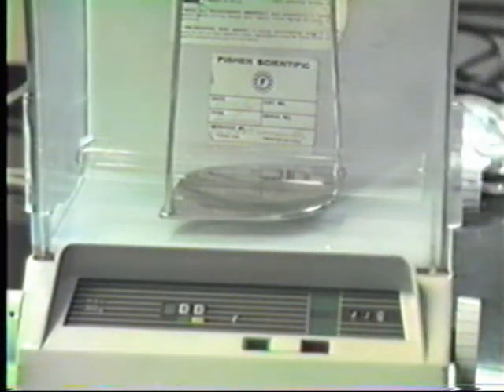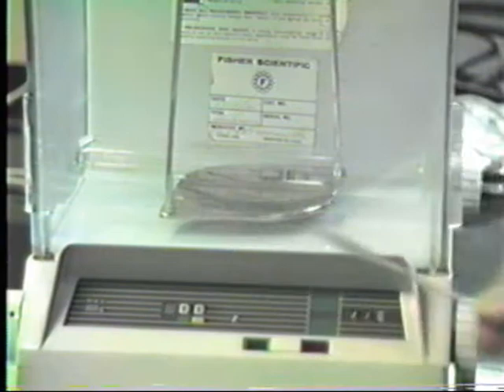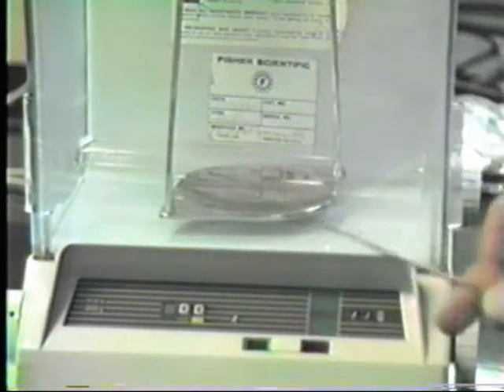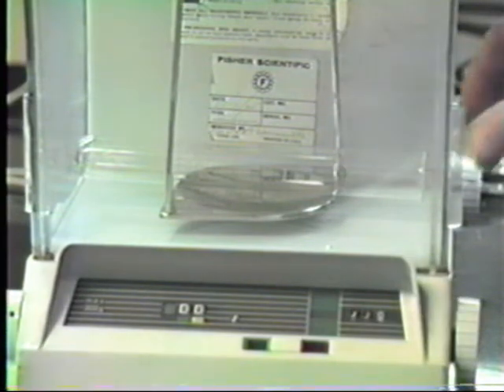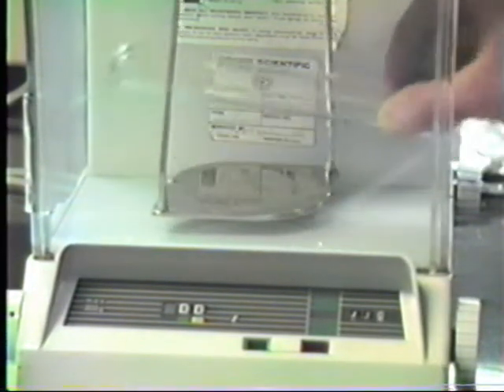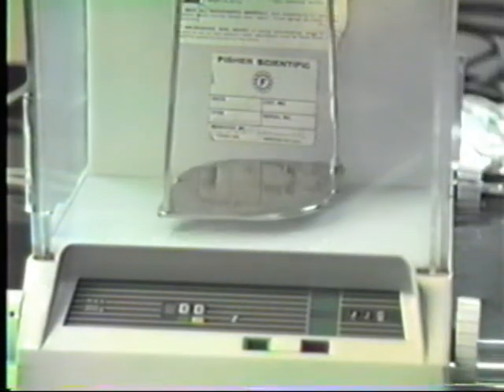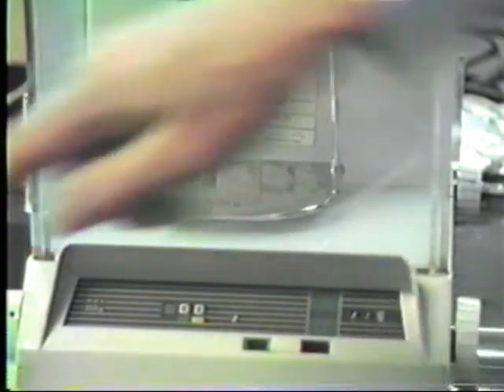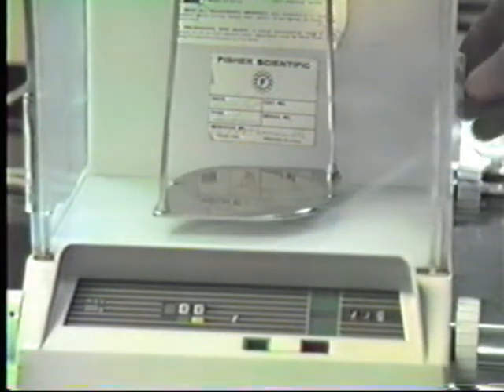You close the door. Then during the weighing and before the weighing, check to see whether or not the ends of the test tubes or the bottoms are touching the side of the balance case or the bottom of the balance case. The test tube itself must never touch the balance, otherwise you're going to get a wrong result. Finally, when you're putting this tube on or taking this tube off the balance, make sure that the beam is arrested. That is, on the side here, you make sure that that lever is turned off.